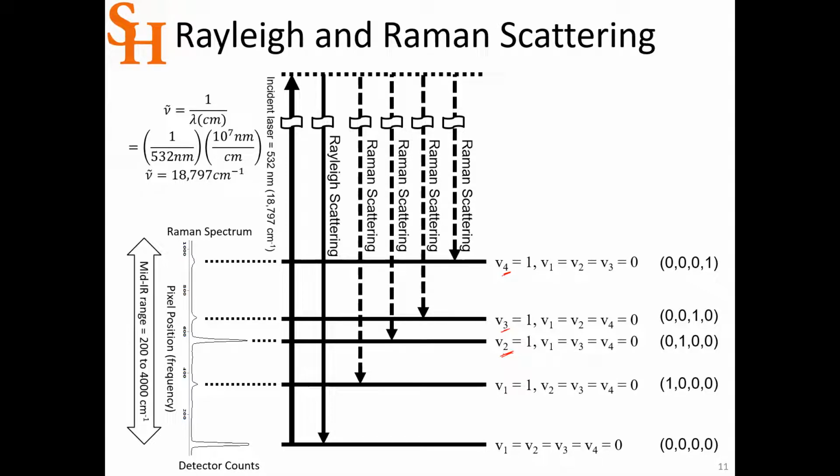And so we want to use normalized intensity. And so in the lab, look at that formula where you take your 0.7 and you divide it by the maximum peak in that spectrum. Let's say 0.7 was the maximum. Now it has a range of 0 to 1 for your absorbance spectrum. And then if 10,000 was your maximum peak in the Raman and you divide that whole spectrum by 10,000, now it goes from 0 to 1. And we can plot those on the same y-axis and call it relative intensity. And so then all your spectra go from 0 to 1.